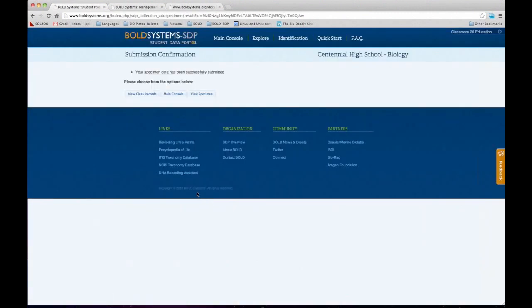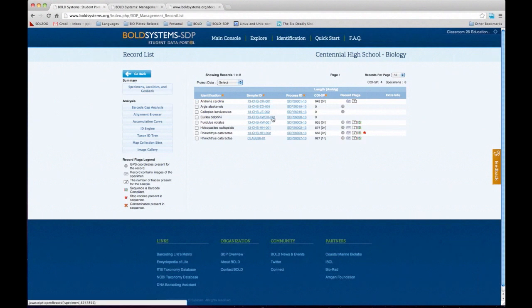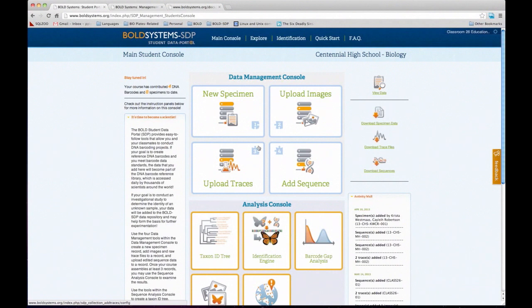Once the record is created, you get a confirmation page. It tells you: do you want to go back to the main console and add more information, view your specimen page, or view the whole class data? Let's go there just to see what it looks like. Here basically is a list of all the class information, and students will have access to this page as well as instructors. There is the new record we just created — it's automatically added to the list. Now that I have a record, I'm going to go back and add a photograph to it.